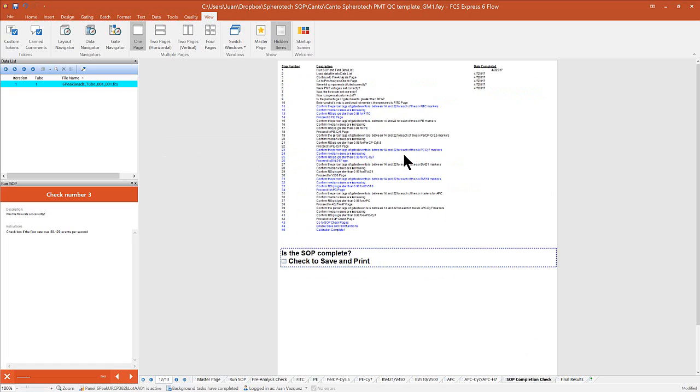It's a really neat and convenient tool where if you want to standardize an application and make it very reproducible regardless of whoever's doing this in a lab, the SOP will allow you to do that. Also, if you needed a training tool where your lab has a constant flow of new people coming in and out, and you wanted to create some type of training tool where you had a template, you had data that you wanted to enter in that template, you can use this SOP to create steps to help guide these new users how to analyze data.